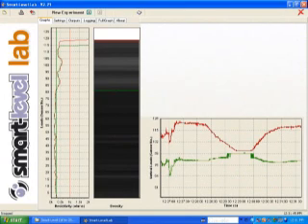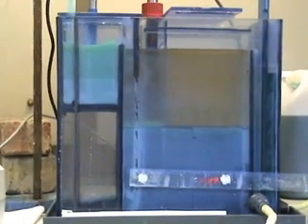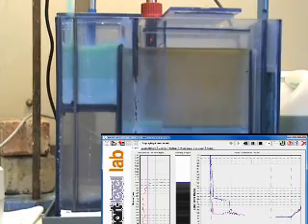This is the screen shown by the Smart Level Lab software. And this is the tank with the flow. You can see the flow and emulsion phase.